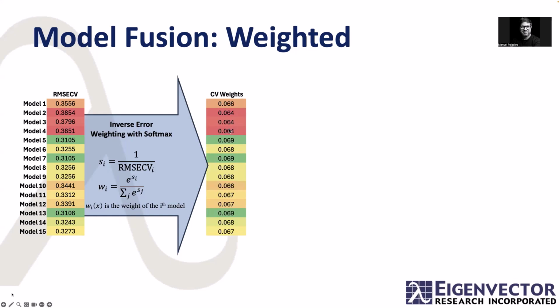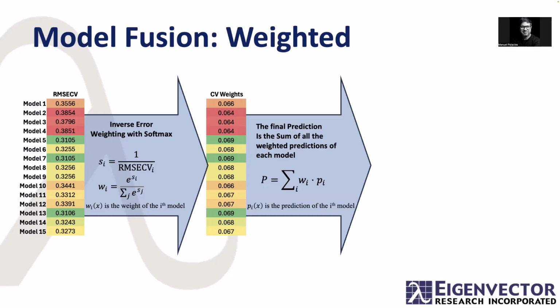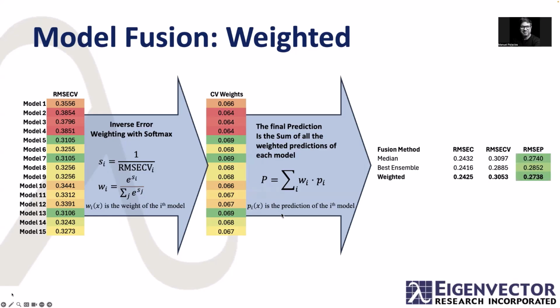This is something that I keep saying that I have to correct: I just left a couple of decimal places, or 3, and maybe I should have another one so you can actually see that there is some difference between these weights. But that's one of the things that we can do, and then we can aggregate the predictions based on those weights.